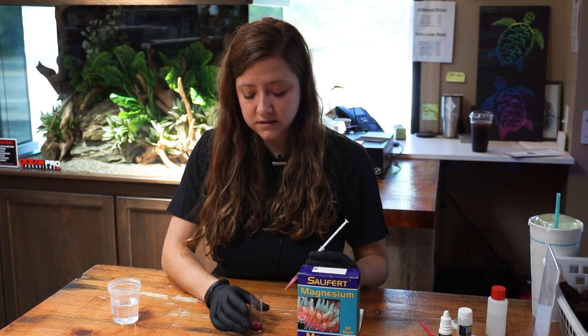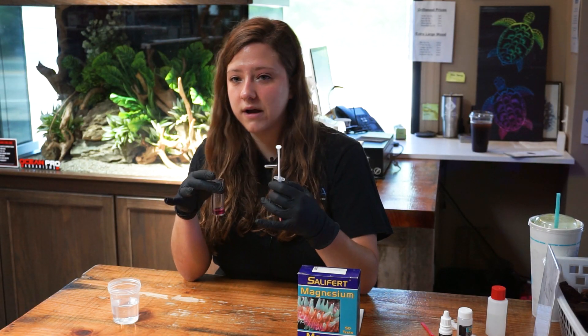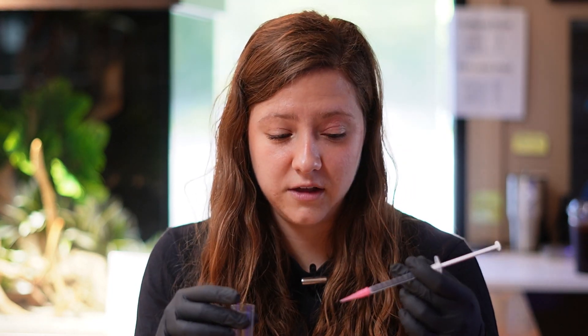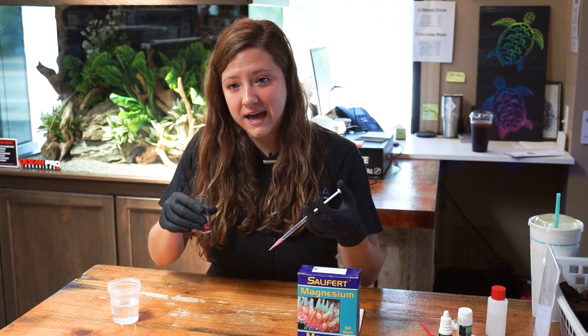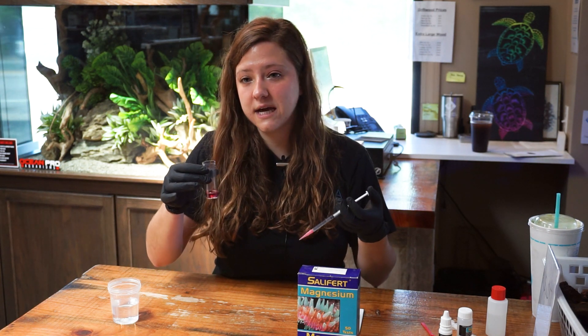The next part is the most intensive. You're going to add the reagent drop by drop, swirling between each drop, until the solution changes from pink to a grayish blue color — whichever color comes up first, that's where you stop. It does take a lot of this reagent to get to that point, so you can add about 80% of the reagent at once. I always find I'm a little too trigger happy when plunging, so I err on the side of caution. I'll start by adding a big bulk of the reagent, and then add about one drop at a time, swirling between.